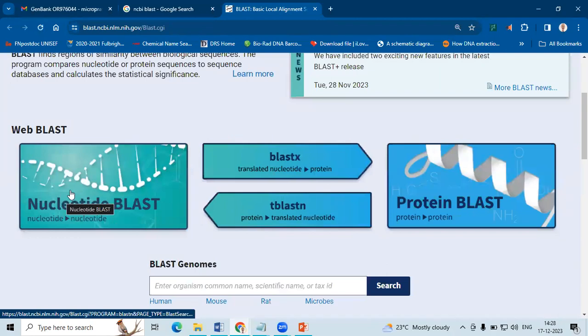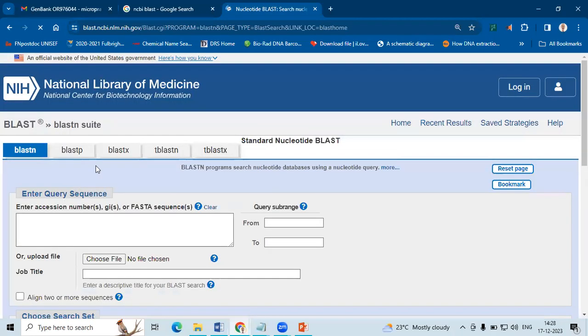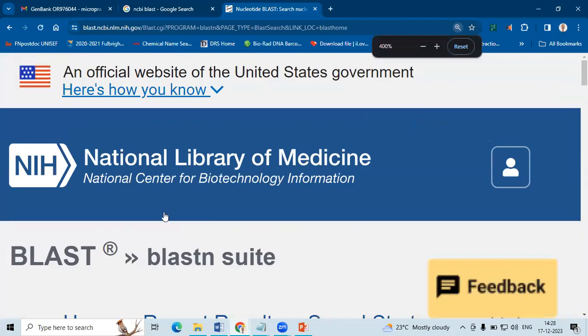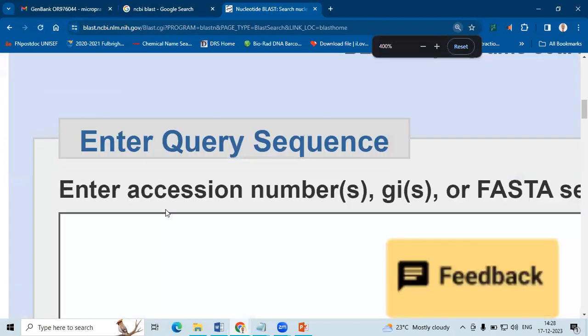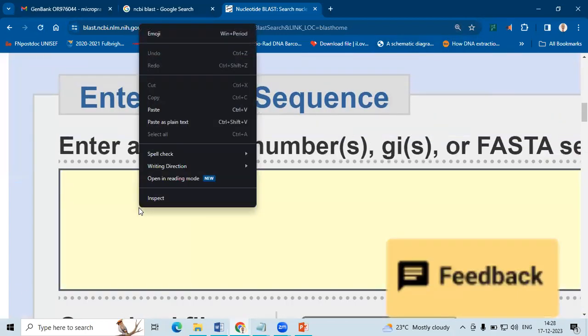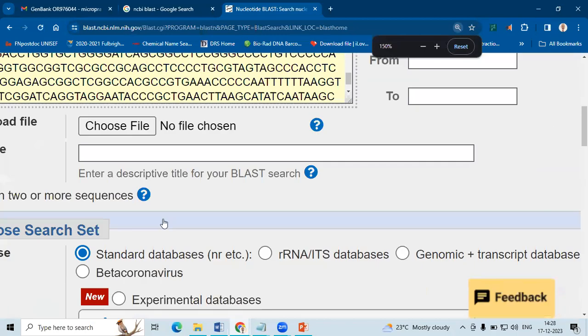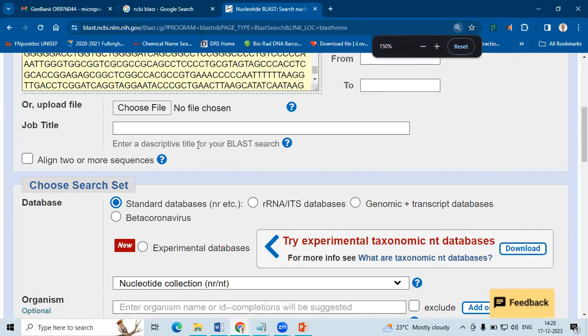Since it is a nucleotide sequence, we are selecting nucleotide BLAST. In this box that is being here, we are going to paste our sequence. So whatever sequences we have copied, we have pasted here.